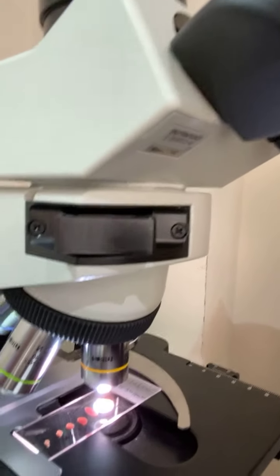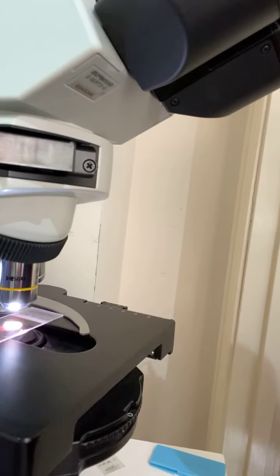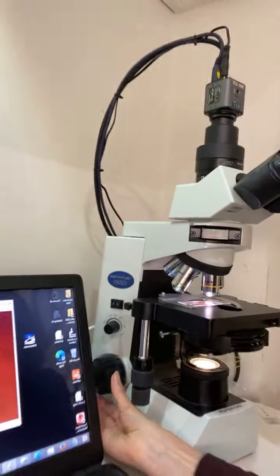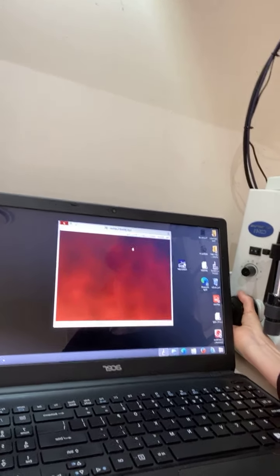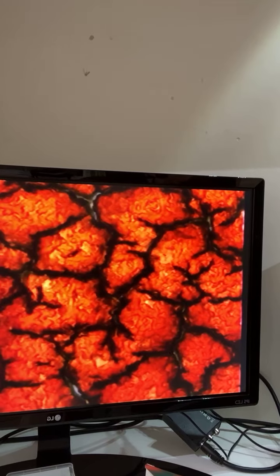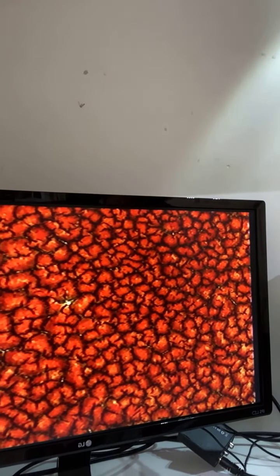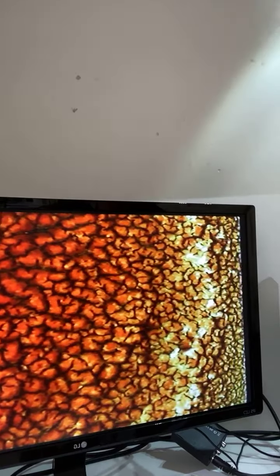I'll show you the dried one. I've just placed it on the microscope and we're looking at the first drop. I'm going to bring that up so you can see it in focus. Here it is on the TV. It's currently on the wrong magnification — that's for live blood — so I'm going to bring it over to the typical one for dried blood. Voilà! That's really nice healthy blood there.